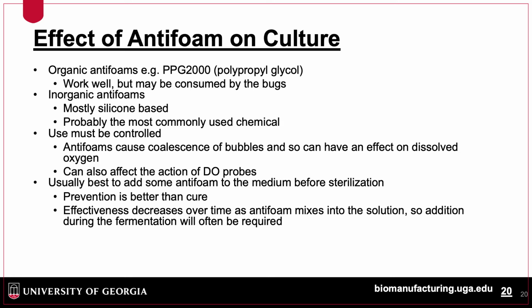Antifoams such as PPG 2000 work to break up foam, but can be used by microbes or cause a decrease in growth. Most are silicone-based chemicals. They can cause coalescence of bubbles and can affect sensors that measure oxygen. Antifoam is usually added before fermentation.